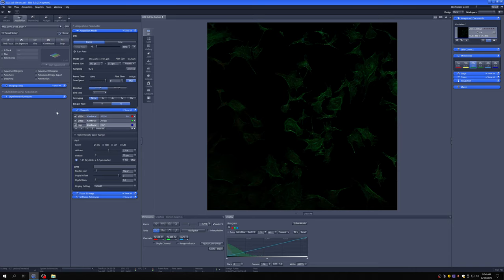So between those two extremes, there's an ideal pinhole setting, and what we recommend for that ideal setting is to go to your longest wavelength fluorophore. In this case, that's Alexa Fluor 594. So we're going to click on Alexa Fluor 594, and then adjust the pinhole size so that it is one airy unit. I'll explain what that means in a moment.